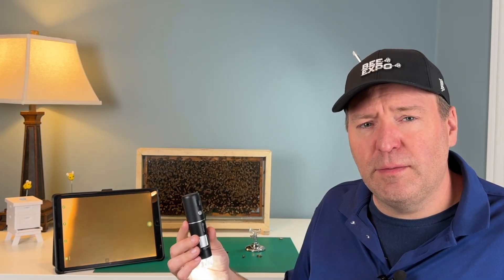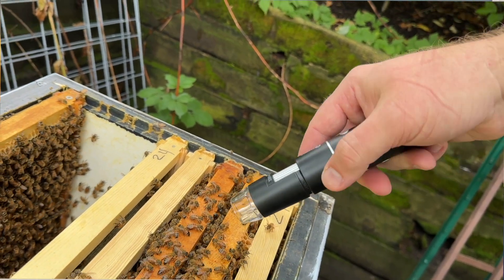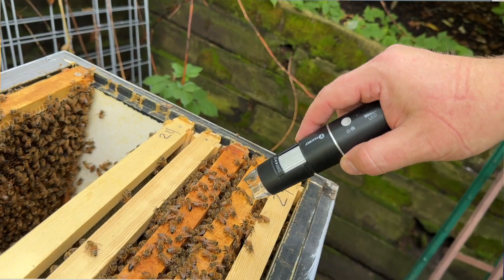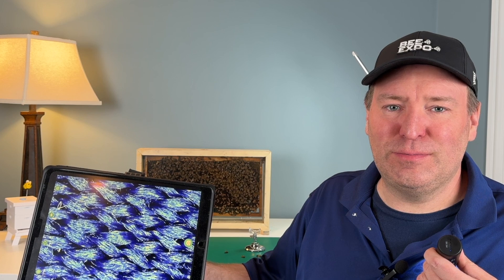Another cool thing about this microscope is that you can take it out to the apiary because it's completely handheld and you can record things that are going on. As an example, this is a picture of my shirt — you can see the threads in it. I think it's a pretty cool microscope.